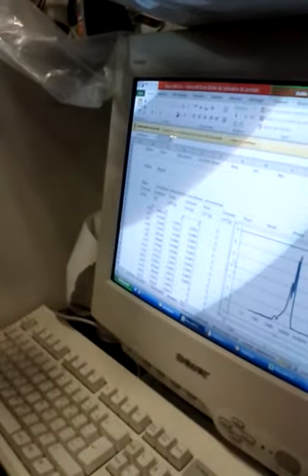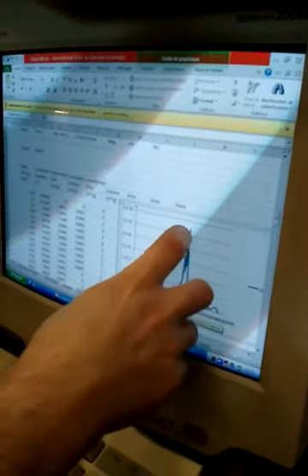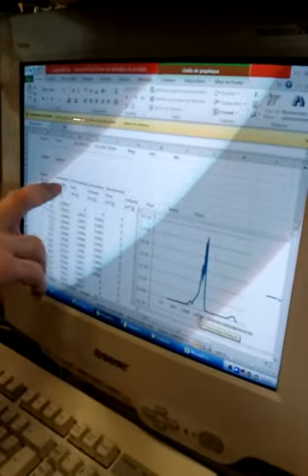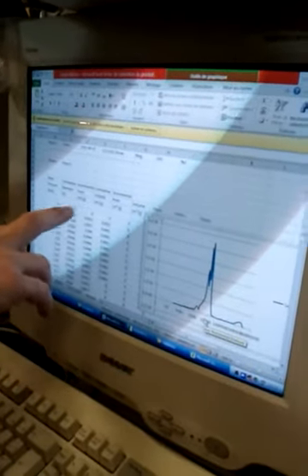For example, for each gram of material there is about 5 × 10^-2 milliliter per gram of pore having this size.